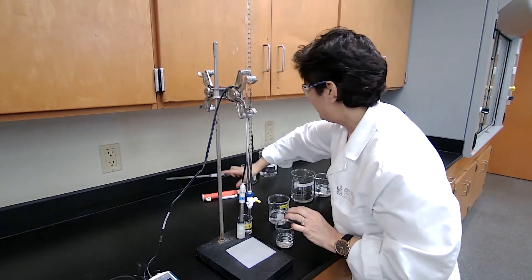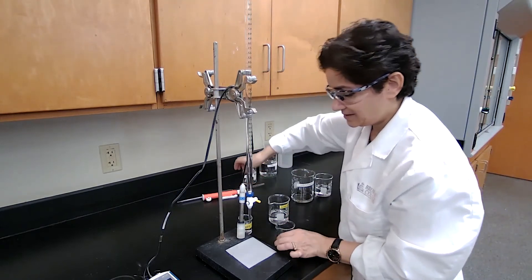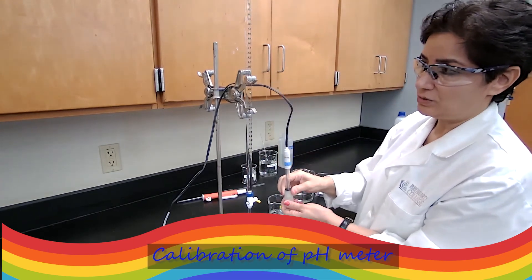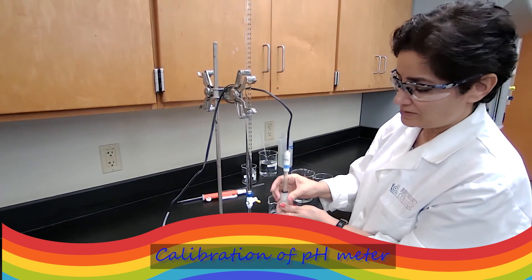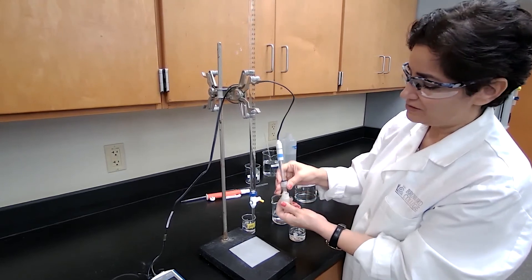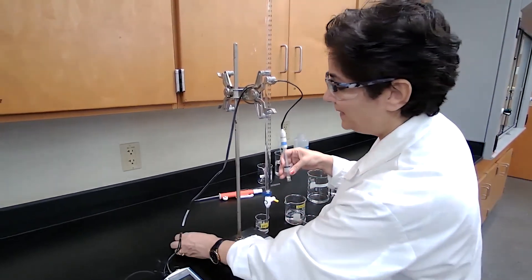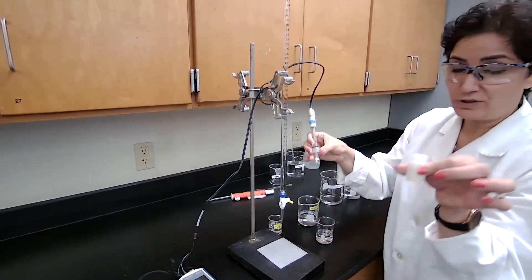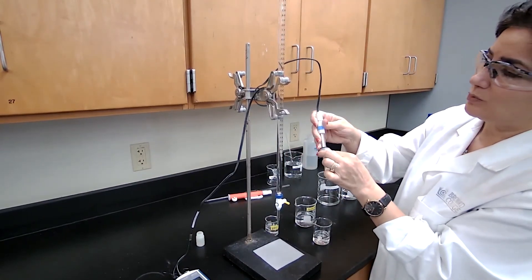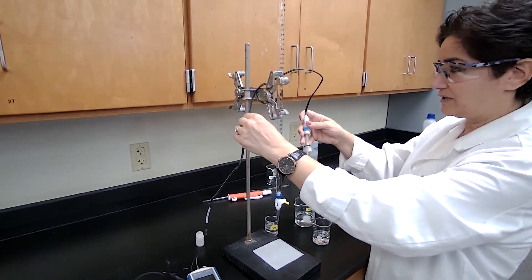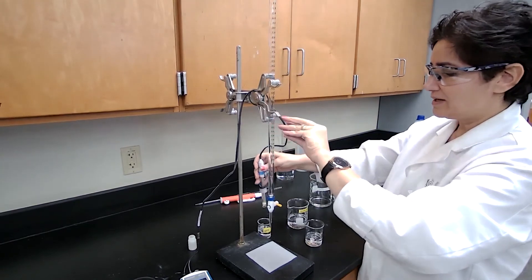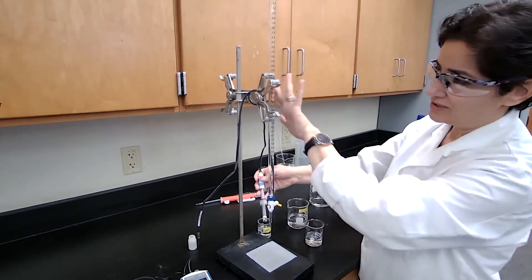I have my acetic acid solution in a beaker. We are using pH meter in this case to record the pH instead of using the indicator. So I do not need acid-base indicator for this titration. We are using the pH meter. The pH meter cell is always in a solution, in a buffer solution, to make sure that the pH meter cell stays wet and it doesn't go out of equilibrium. I wrap this wire around the burette holder because it's heavy and I don't want to drop it. It's just for security.